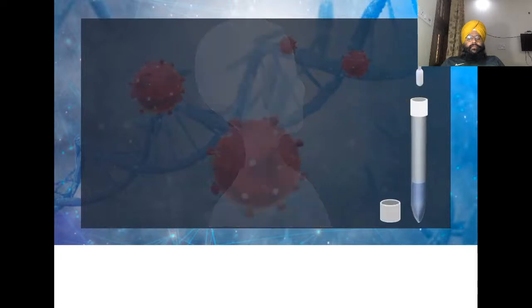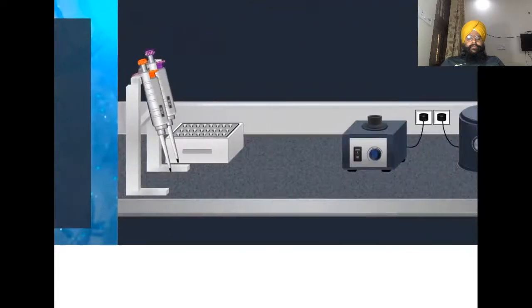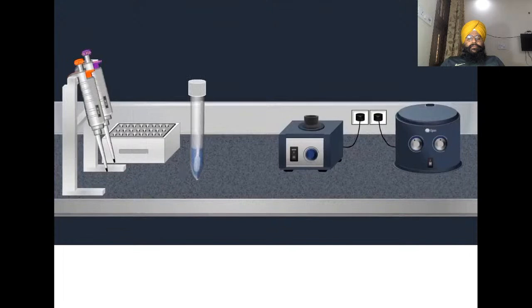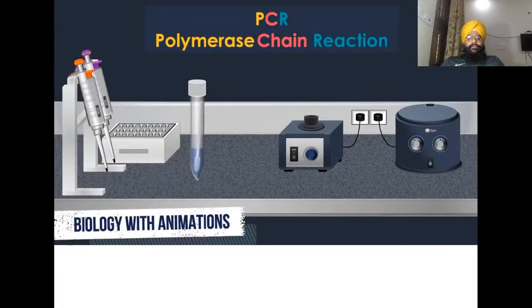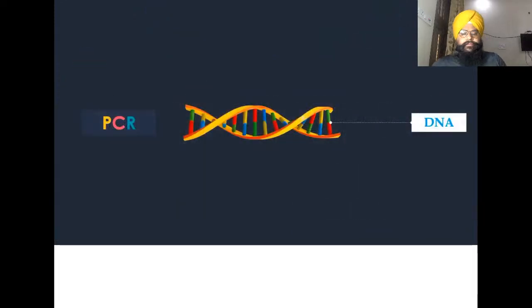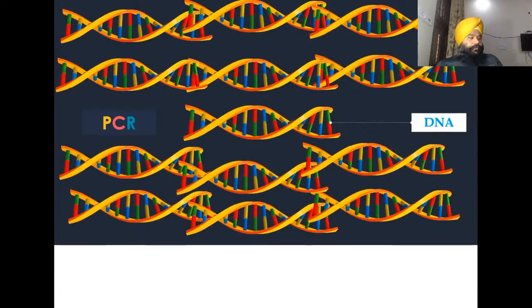Once the swabbing is applied, the swab is placed immediately into a sterile tube containing a viral transport medium. The standard method of coronavirus testing is polymerase chain reaction, PCR, which is a method widely used in molecular biology to make millions to billions of copies of a specific DNA fragment rapidly.